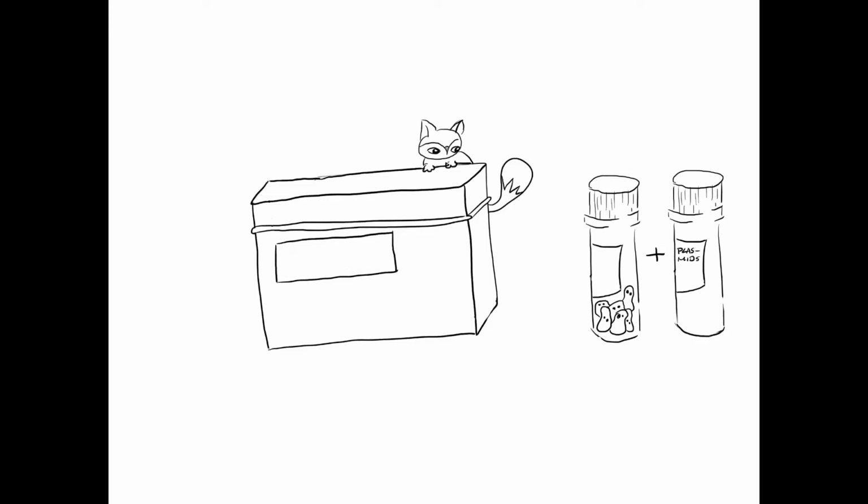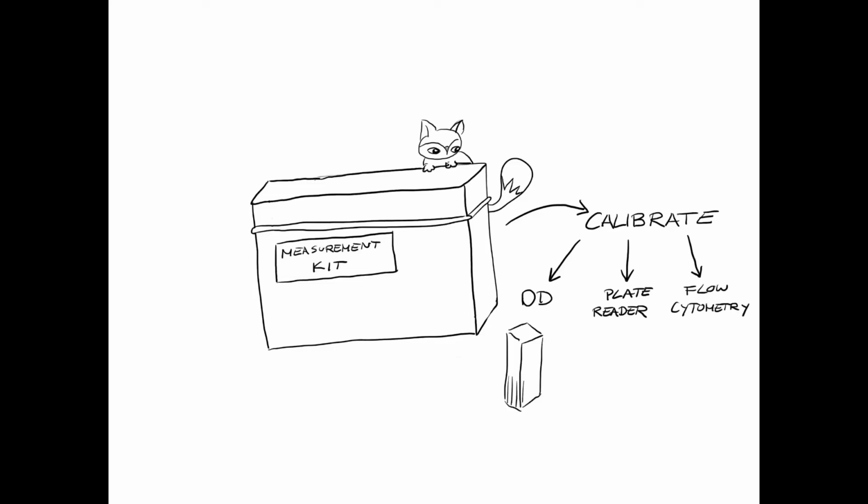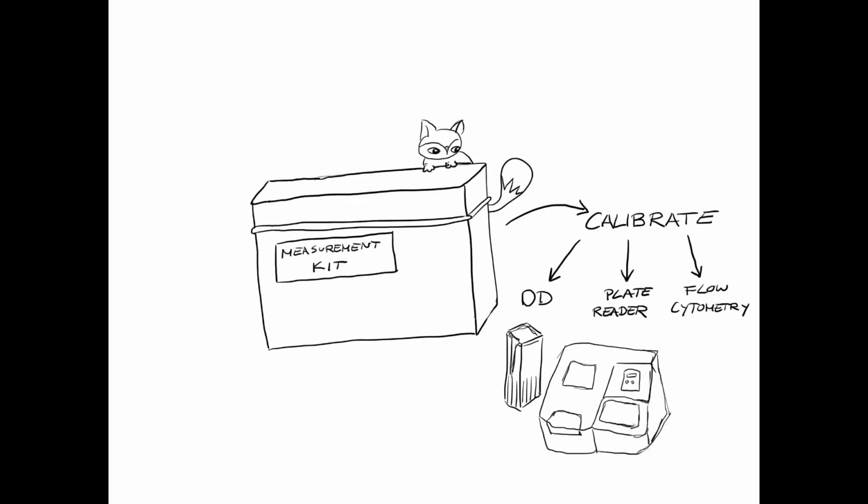Measurement kit. This should be stored at room temperature. Some of your projects may require fusion proteins which include GFP in them. You can use this kit to calibrate your plate reader, calibrate the OD measurements, and for flow cytometry fluorescence calibration. The iGEM website has very detailed tutorials and spreadsheets that you can use for your measurement validation. In addition, the iGEM measurement committee will help you review the calibration data that you obtained and advise you if there are any problems.